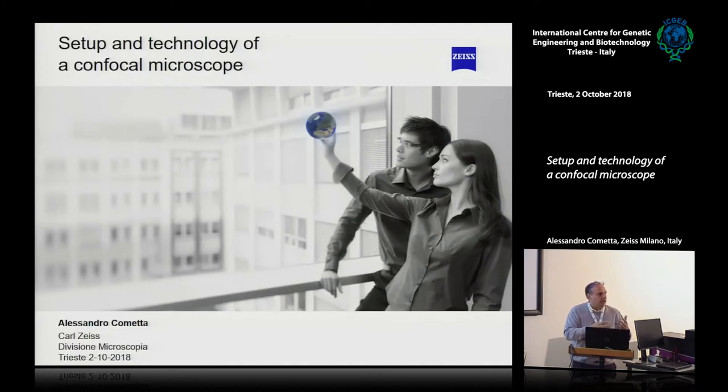exactly the picture you want to have. This is a great advantage, and this is a very great risk, because in confocal microscopy you can have the picture you really dream of, even if it's not the correct one. So you have to work correctly to have a real picture and not a fake.